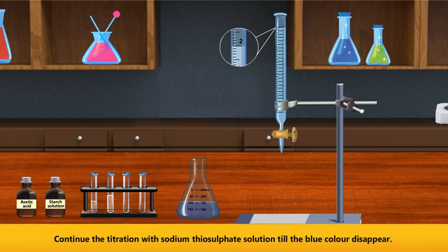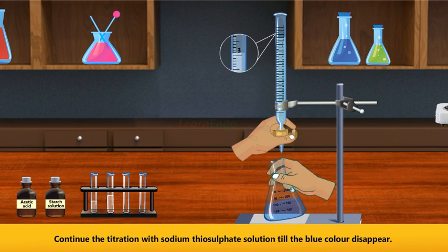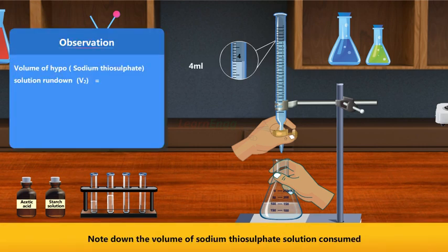Continue the titration with sodium thiosulfate solution till the blue color disappears. Repeat the titration for concordant values. Note down the volume of sodium thiosulfate solution consumed.